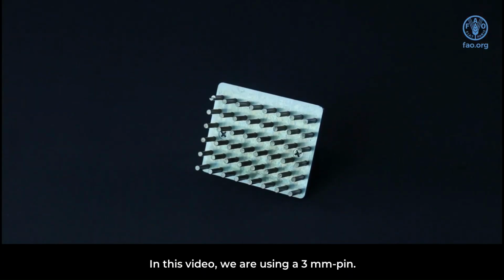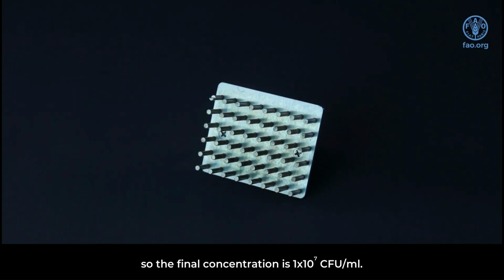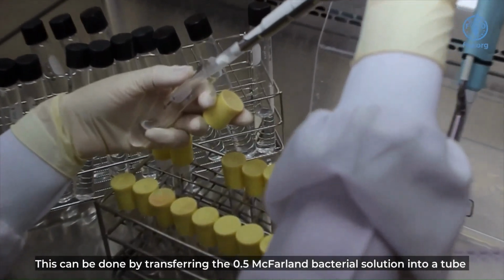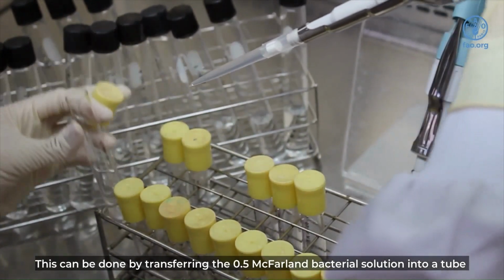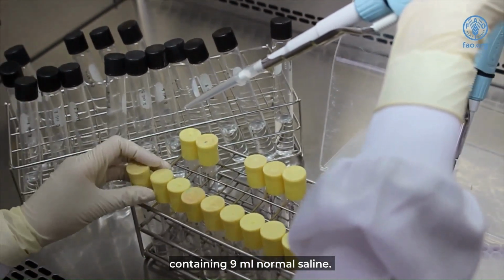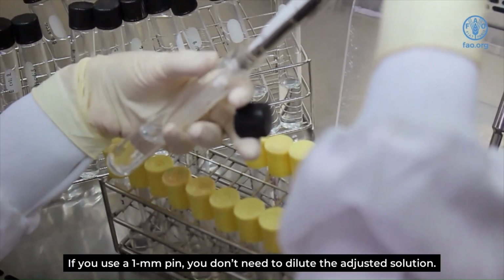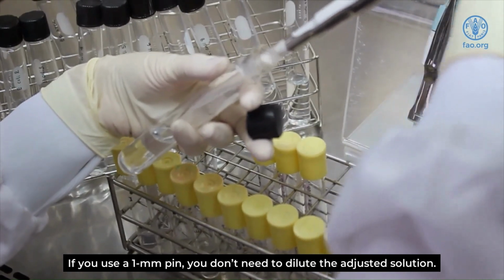In this video, we are using a 3 mm pin. We need to dilute the adjusted solution using tenfold dilution, so the final concentration is 1 times 10 to the power of 7 CFU per milliliter. This can be done by transferring the 0.5 McFarland bacterial solution into a tube containing 9 milliliters normal saline. If you use a 1 mm pin, you don't need to dilute the adjusted solution.